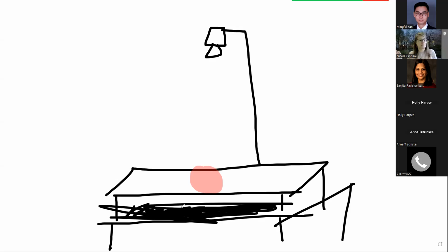It was awesome. It was a really great setup, in a small room by itself with a light stand and lights coming from either direction in a dark room. The photos that came out of this setup I thought were brilliant because they required minimal modification of the background. They didn't have blood, they didn't have shadows, but it was a huge deal, right?